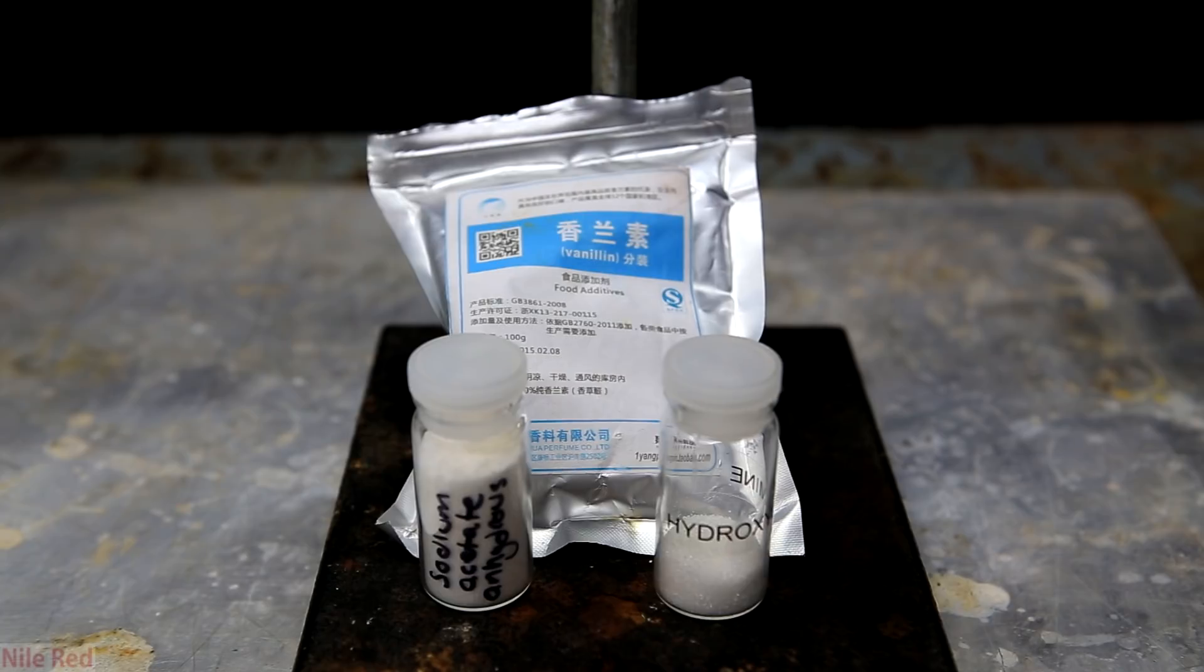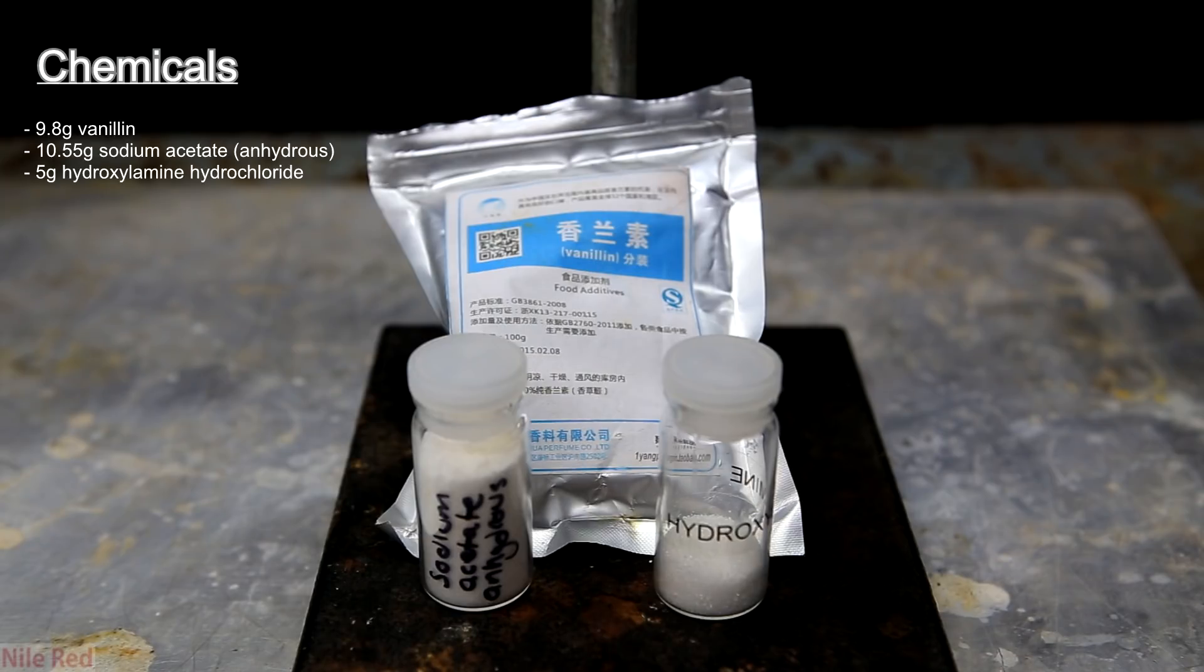Making the sodium acetate is pretty easy and it just involves mixing vinegar and baking soda but the hydroxylamine hydrochloride is a little bit more involved. Anyway I used 5 grams of hydroxylamine hydrochloride, 9.8 grams of vanillin and 10.55 grams of anhydrous sodium acetate.